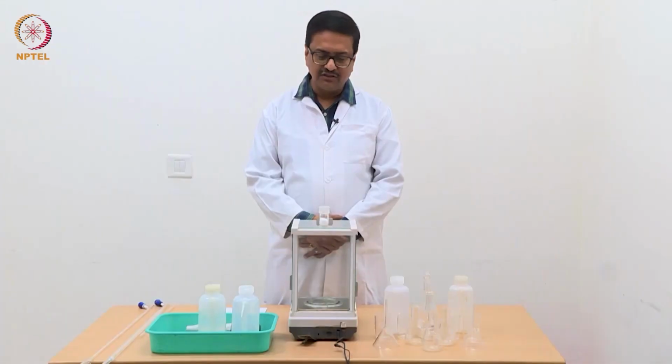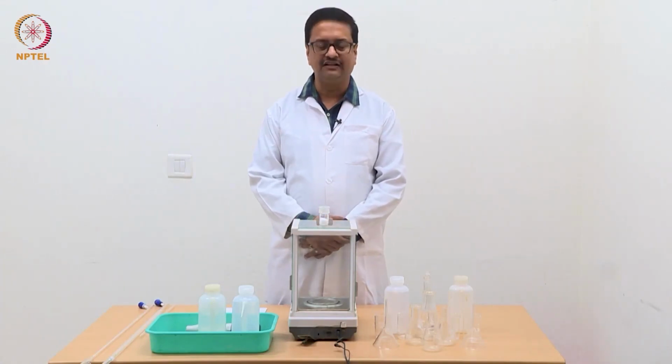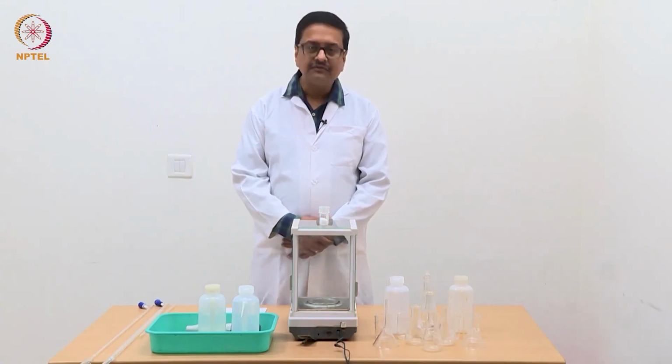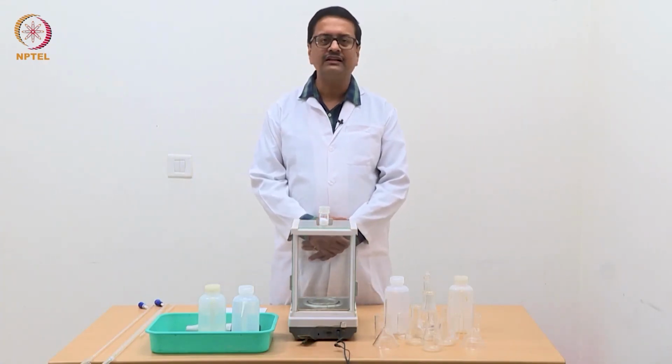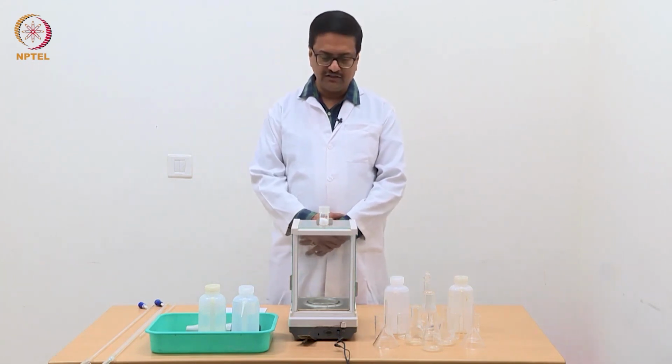As all of you probably know, because you have done some laboratory courses in your college, to do any quantitative estimation, one requires to prepare a primary standard solution. So, in these acid based titrations, we need to use oxalic acid as a primary standard, and I will first show you how one can very accurately prepare a solution of a primary standard.